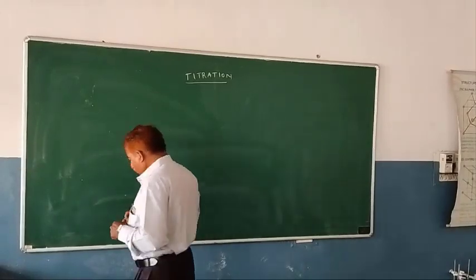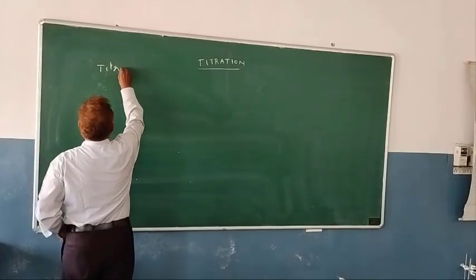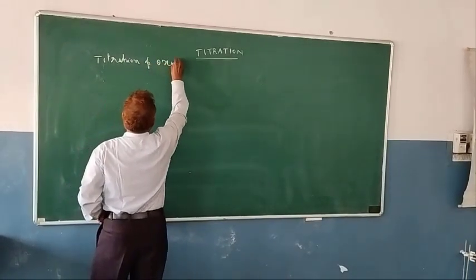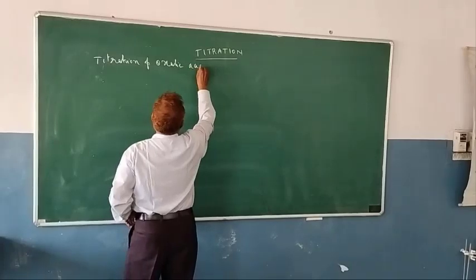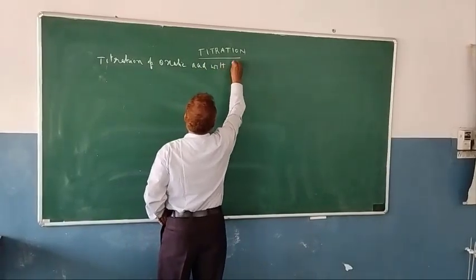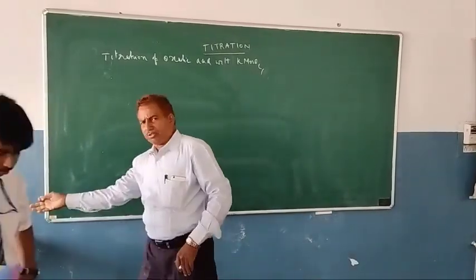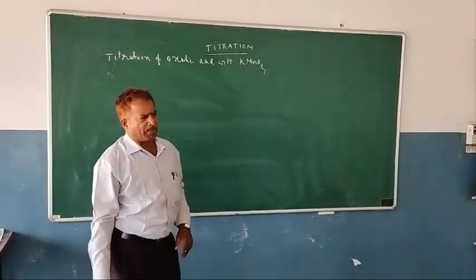Permanganate titrations. So, permanganate titration of oxalic acid with permanganate. Titration of oxalic acid with potassium permanganate.